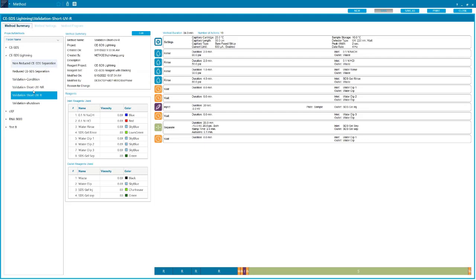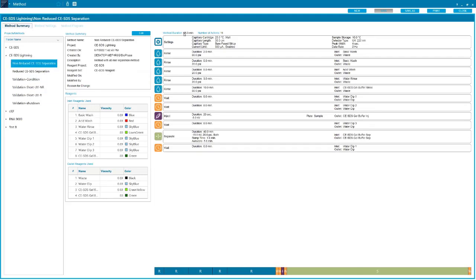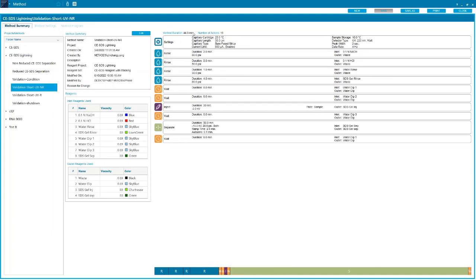But if we swap over here to our non-reduced separation, that's about a 65-minute separation with our standard method at the launch with the system. And if we go down here to our Lightning method, there we go. Now we're down to about 44 minutes. So again, we're shortening it by over 20 minutes a sample for this particular method. And the majority of that is all just around here in the rinse time. So we do shorter rinses, we do potentially higher pressures, all to really just speed up this whole process. We originally probably had a more conservative approach to those rinses, but now we're really analyzing up to about 1.5 times faster than what we had before.